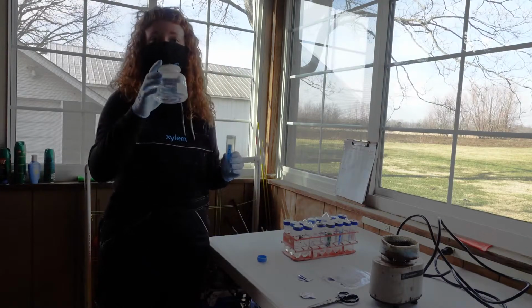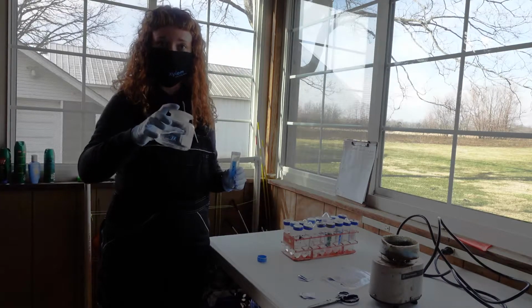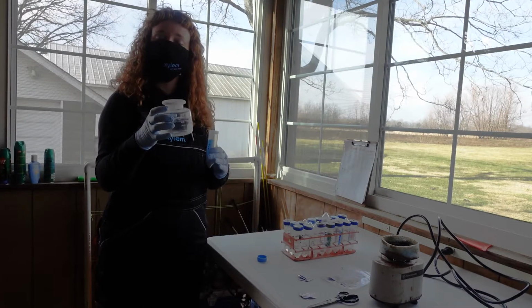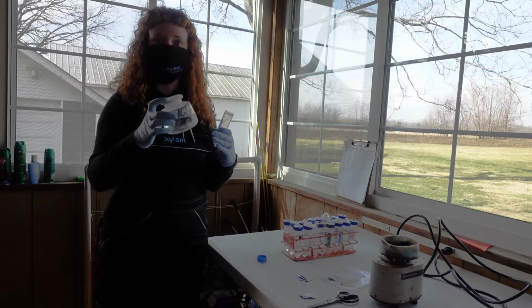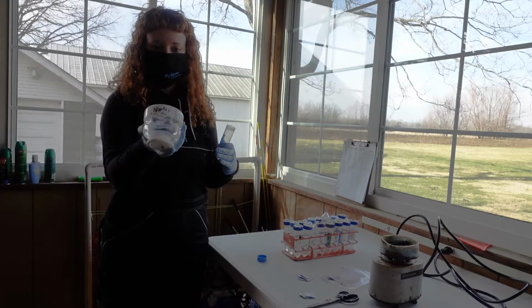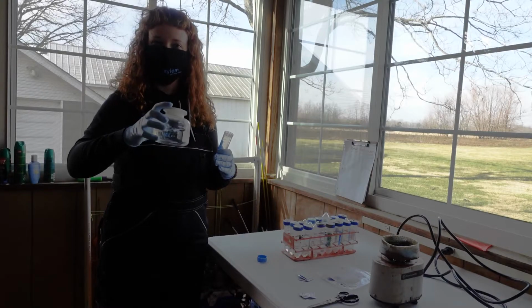Very important step. I'll take my field sample, I'll invert it a couple times. This is important because some of our nutrients are bound to sediment that is suspended in the sample. It's important that we get that suspended. We don't shake, we just invert.